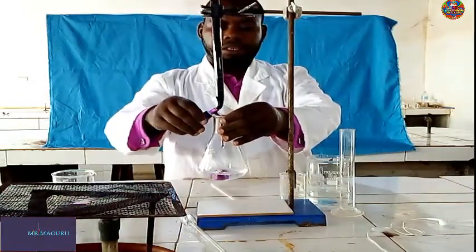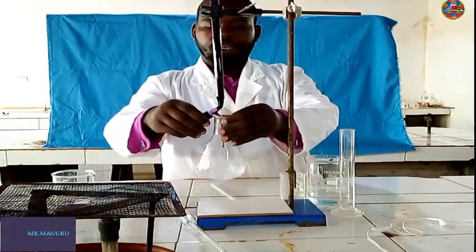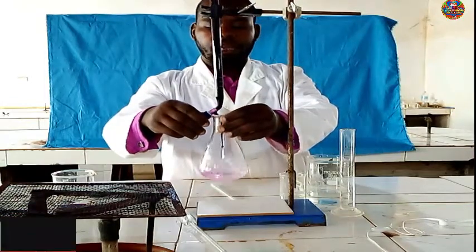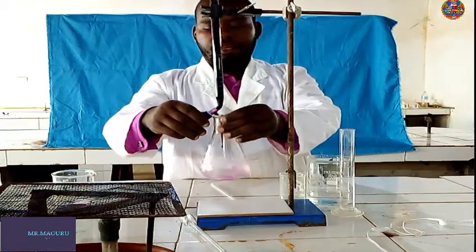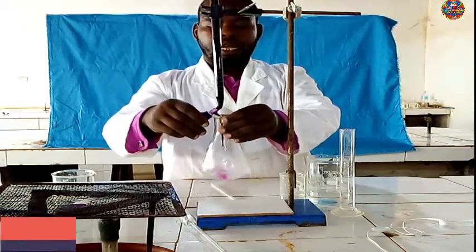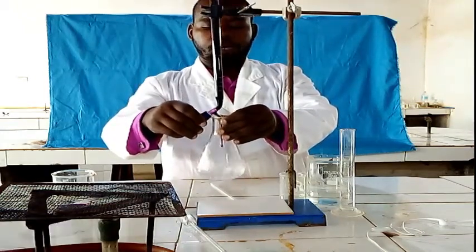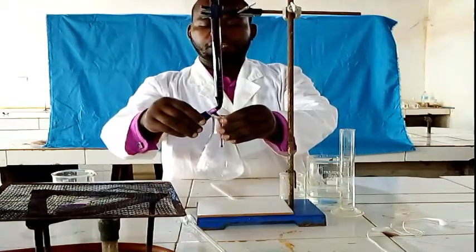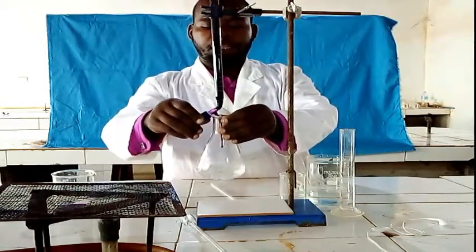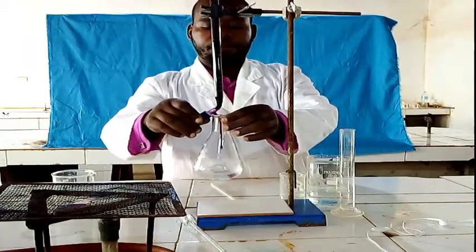At the first titration, the reaction is slow, but as time goes on, the reaction will be faster. Make sure your eye is pointing to the conical flask. I'm doing the titration here. You see the color is coming and disappearing. The color change is pink.